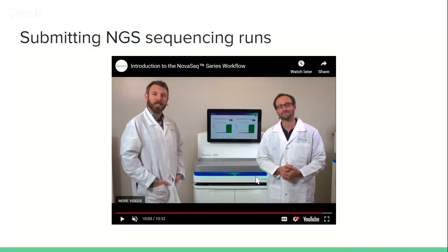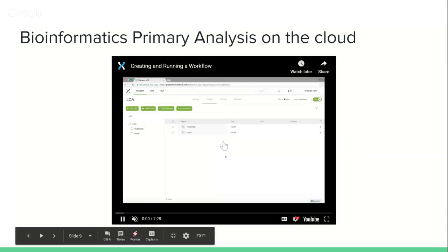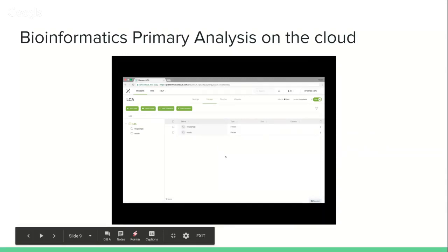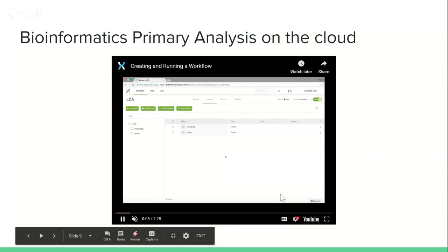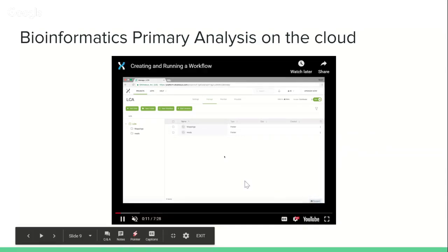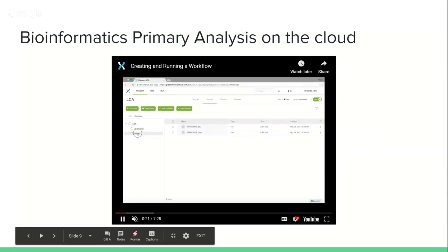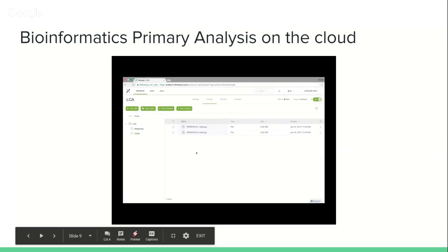Stream the data on the cloud, get the FASTQ files automatically on BaseSpace. So now you've got a bunch of FASTQ files. This is where the fun happens. I'm going to show you one of the platform's offerings to do this, which is DNAnexus, which has a web interface, but importantly also has a very nice command line interface and API, Python API or other types of API, and then you can design and implement all your bioinformatics workflows and then submit them in batches programmatically.